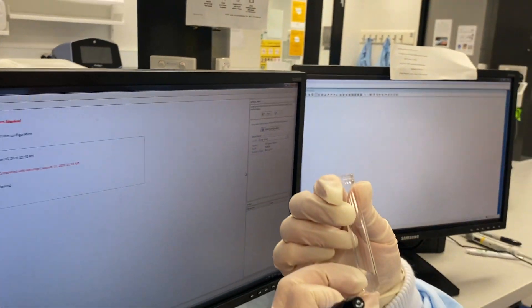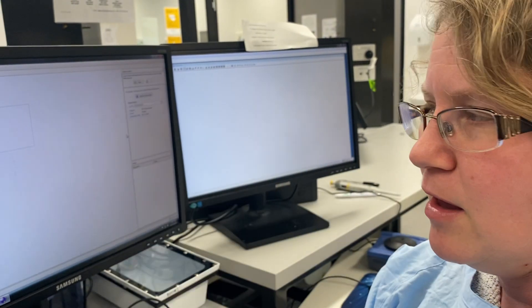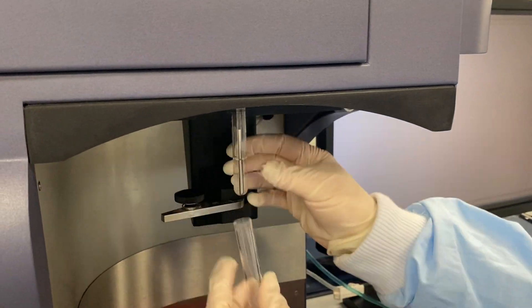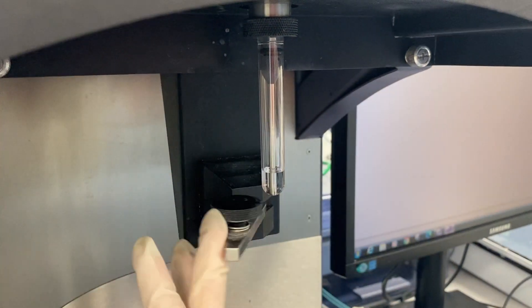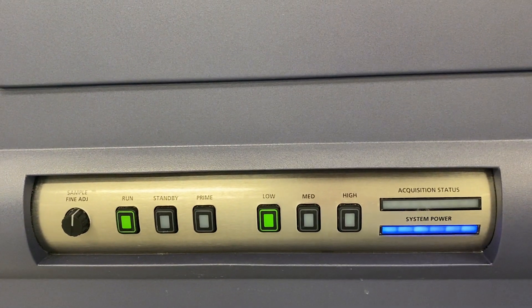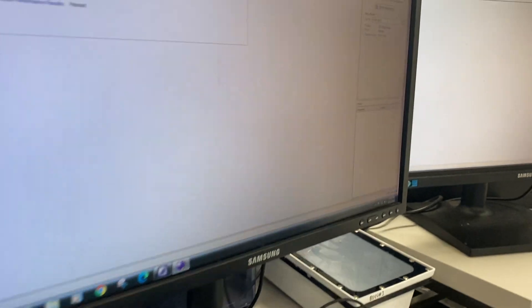You run around one millilitre and two drops to run CST. You put it on by moving this one backwards, just pulling it off, and put it on like that. Go and press running on low for CST — it's very important — and you click run.